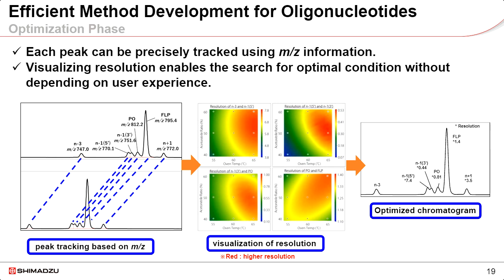And when we do that, we can then visualize our design space resolution and choose an optimized chromatogram that will be in the center of one of the high separation areas, so that if we do have subsequent changes to environmental conditions or instrument integrity, we still can achieve the separation needed when those changes are small.